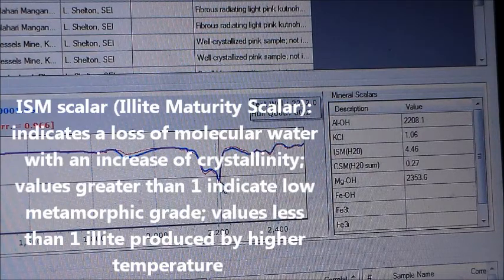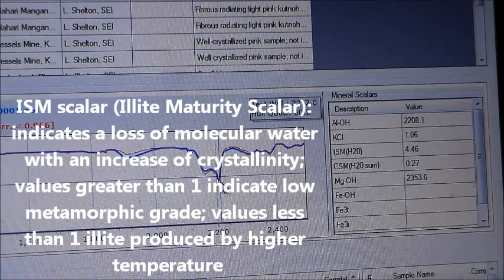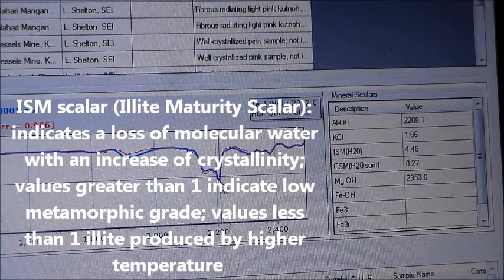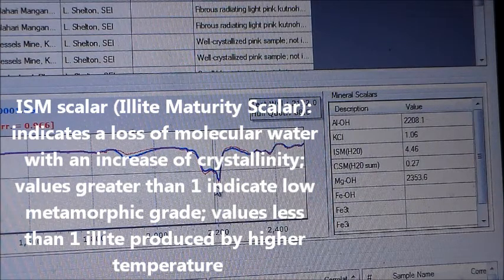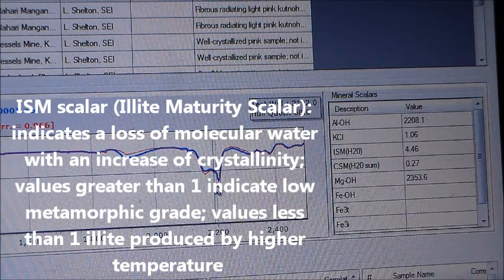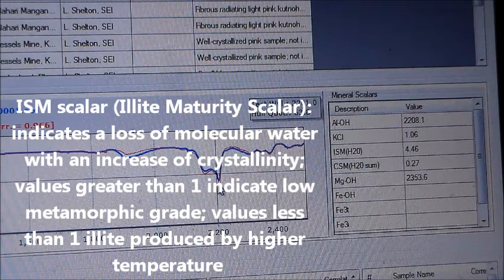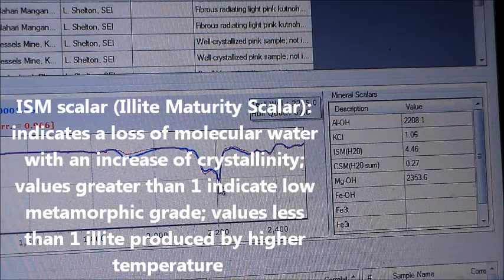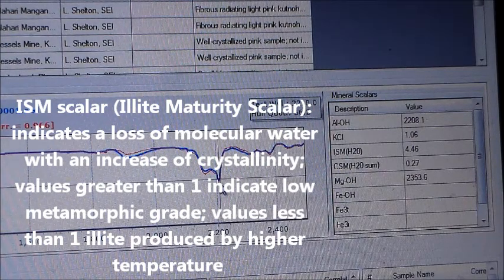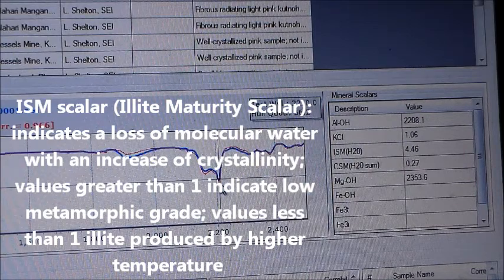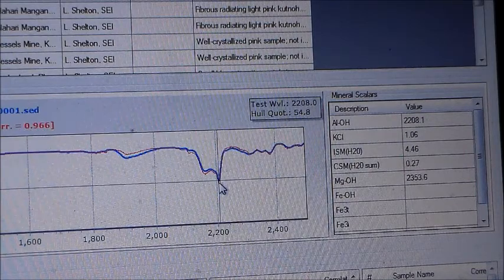The Illite Maturity Scalar, ISM, indicates a loss of molecular water with an increase of crystallinity. ISM scaler values greater than 1 indicate a low metamorphic grade illite. Values less than 1 are generally associated with illite produced by a higher temperature.